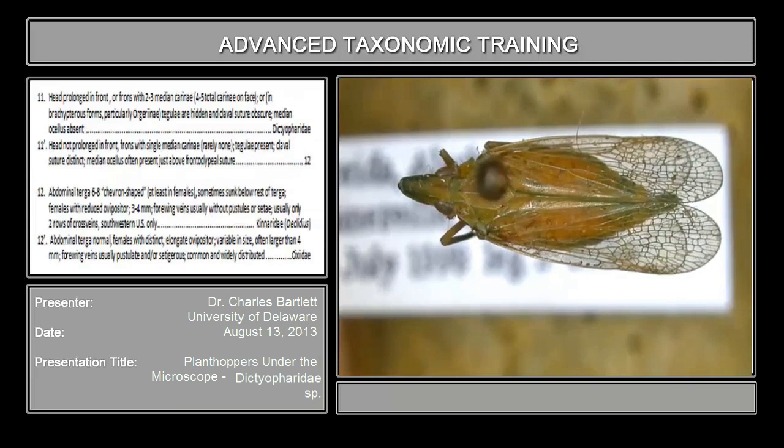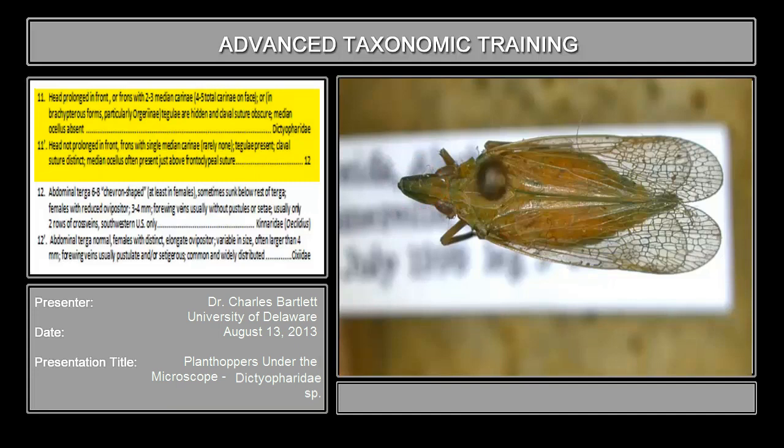The next couplet asks about the head being projecting. You can see right here the head is definitely projecting; the vertex is elongate. The next part asks for the frons to have two to three median carinae. The head is projecting, and it is worth looking for those carinae. If you arrange yours clearly, you will see there is a median carinae, an intermediate carinae, and a lateral carinae on both sides — so this does have five total carinae. In brachypterous forms these are tegually hidden, but this is a macropterous form. So this is Dictyopharidae.